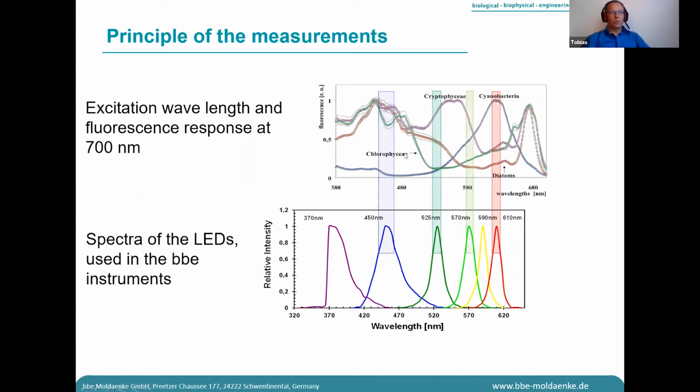But we are not interested in only those two of them. So we have some other LEDs to separate the other algae classes. And we have also implemented in the newest devices an LED at 370 nanometers. That is for yellow substances, because yellow substances have an excitation in this area and also have a fluorescence at 685 nanometers, where we measure.